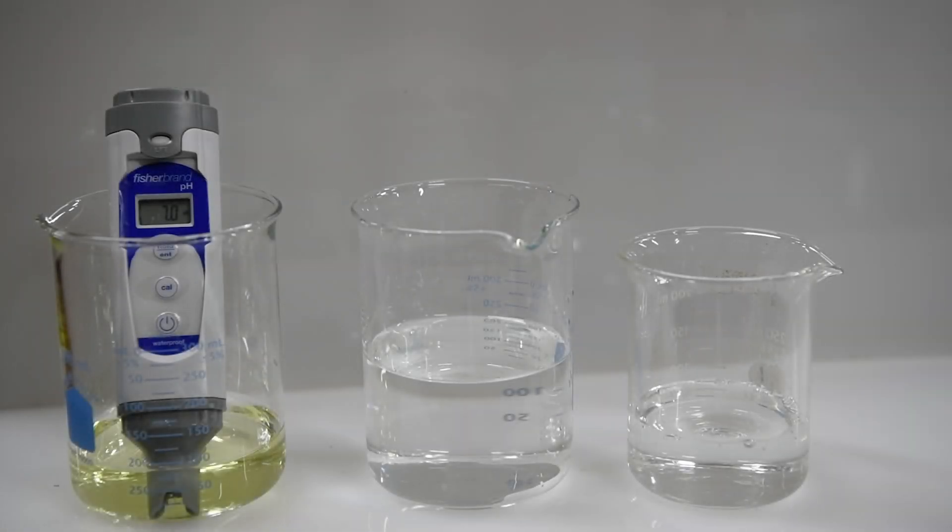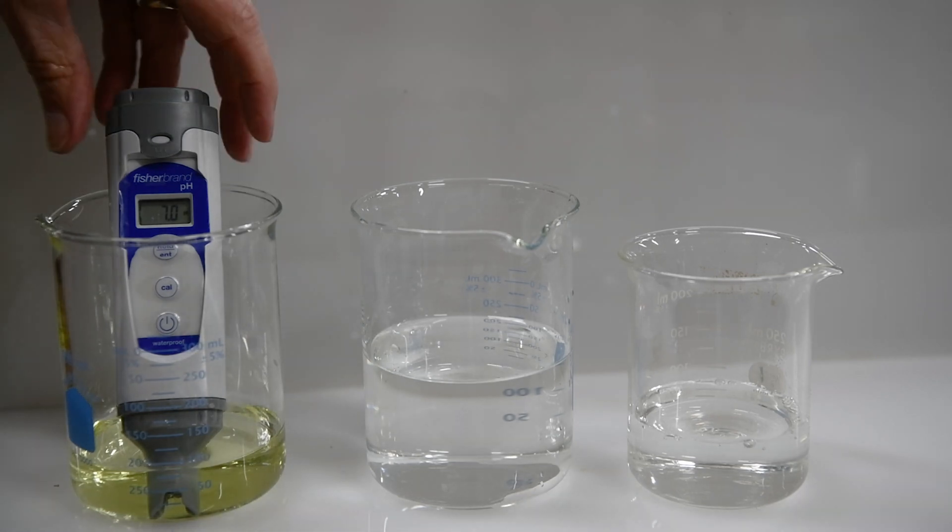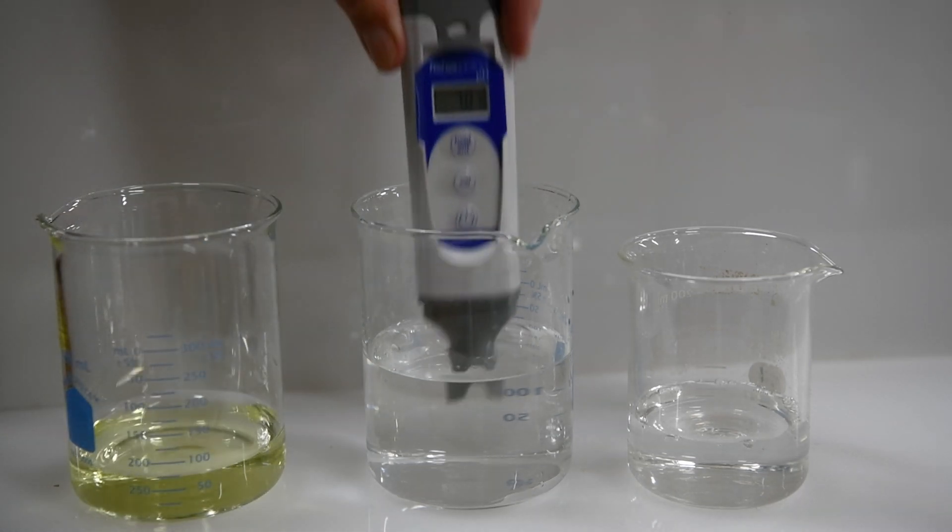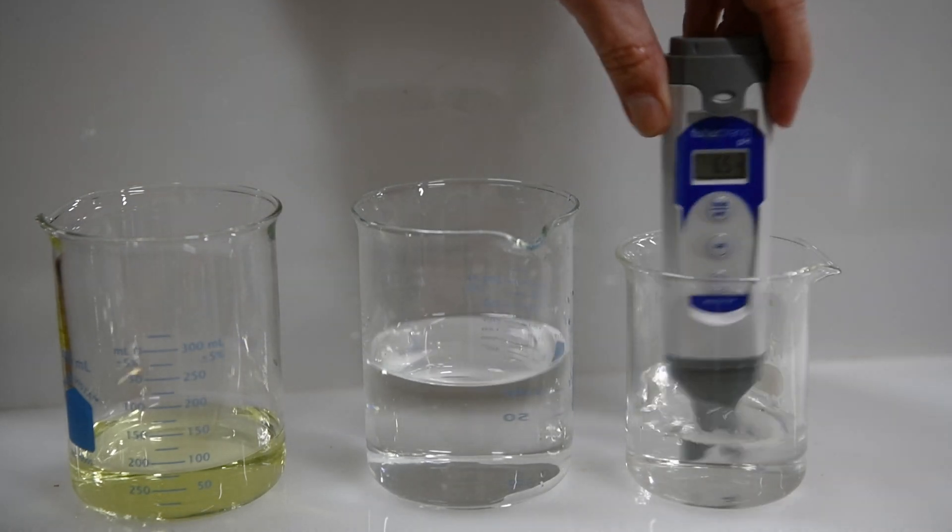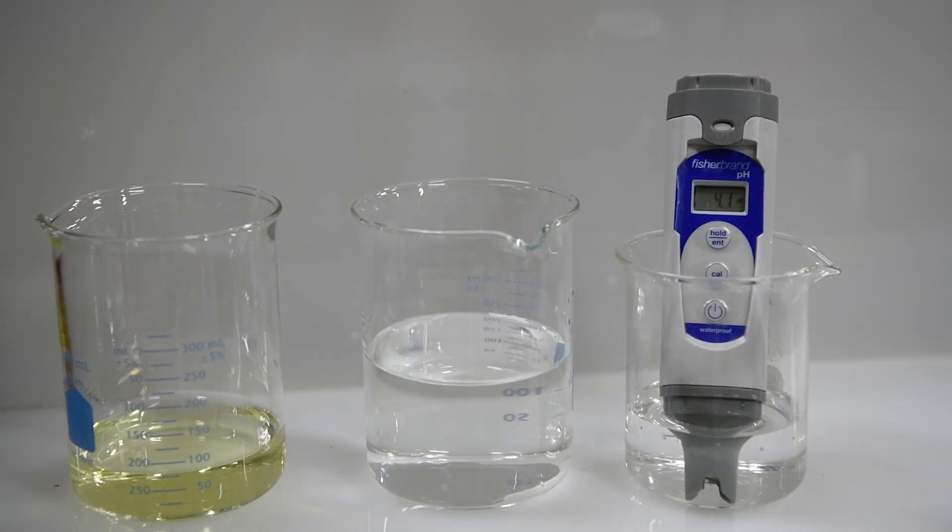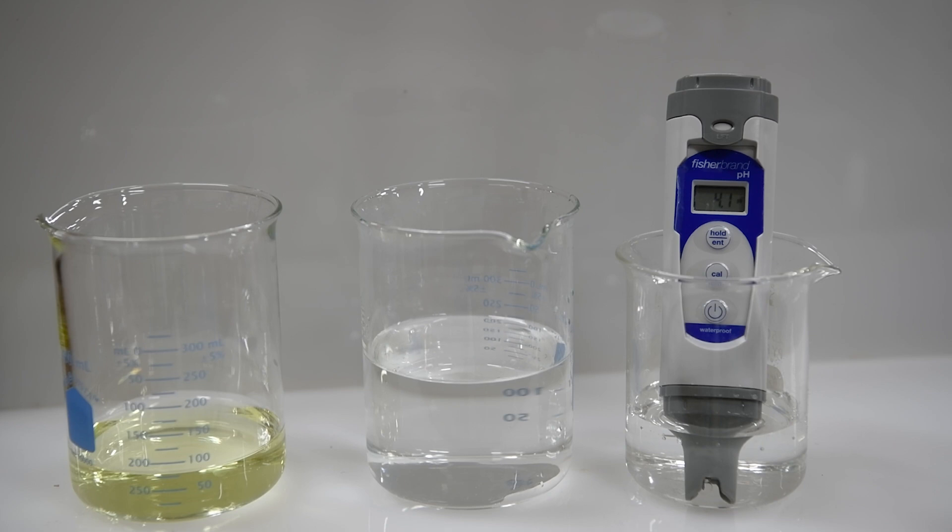Next, we'll test a sample of 7up for comparison. So once again, we'll rinse off our pH meter, place it in the 7up, give it a moment to balance out. And it looks like it's pH of 4.1.